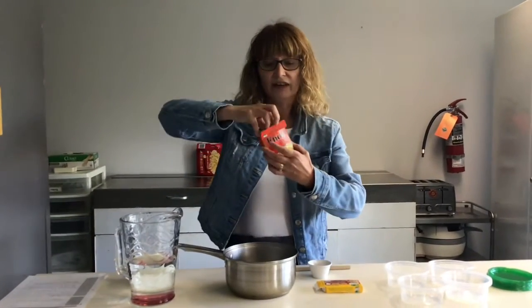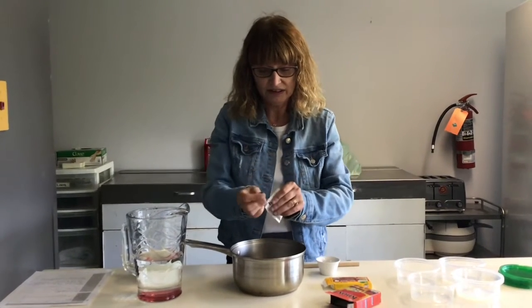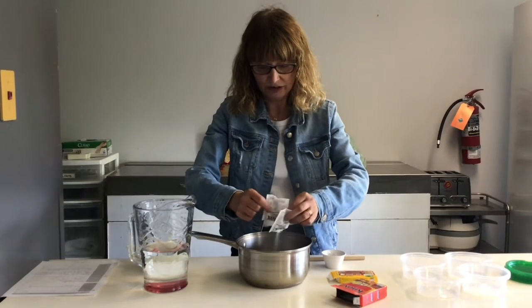And this is gelatin. So we will open two packages of gelatin and put that in there.